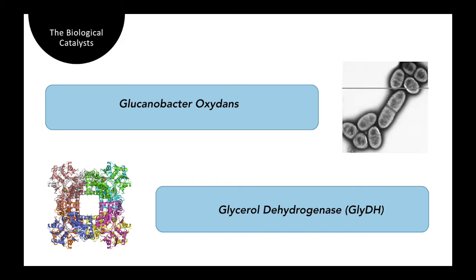After completing a literature review of the biological methods of DHA production, the following procedure has demonstrated a 94% efficiency of glycerol oxidation, and in laboratory models, a DHA concentration of 27.2 grams per litre was observed after a 5-day incubation. The strain of bacteria shown to most efficiently produce commercial quantities of DHA is Gluconobacter oxydans.